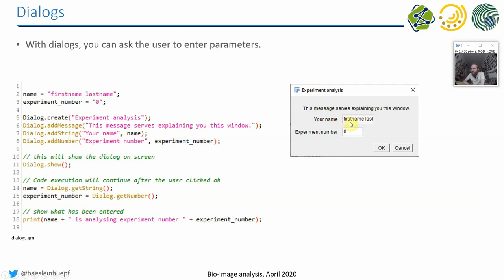Default value in case of name is a bit tough, because I don't know who will execute this program later on. But I can, for example, suggest the user to enter his first name and last name by writing a default value like that. So you see here, the variable name is handed over as default.